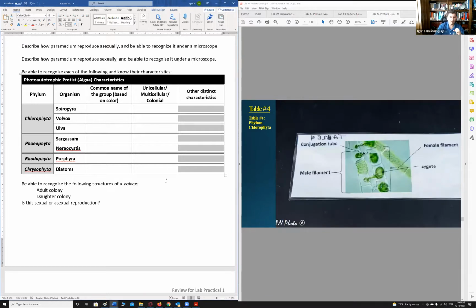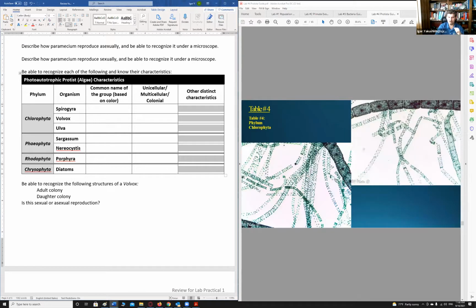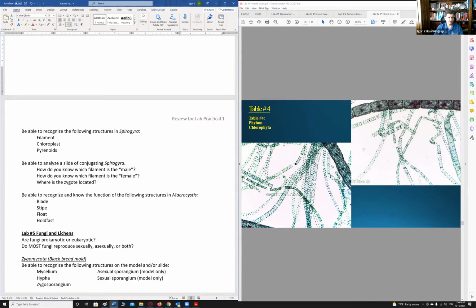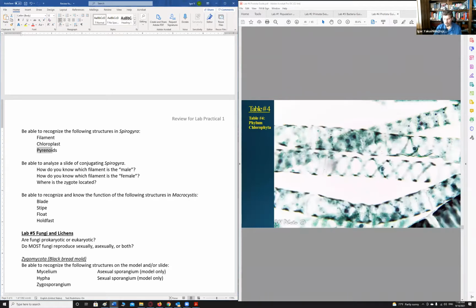All right. Now, whenever you're looking at the vegetative strand, you can clearly see the strand, right? The nuclei, and that particular spiral is nothing else but the chloroplast. And then, of course, we talk a little bit about the pyrenoids. Whenever you're looking at larger magnification along the chloroplast, you will see those dark round spots. That's the pyrenoids. This is basically accumulation of starch.